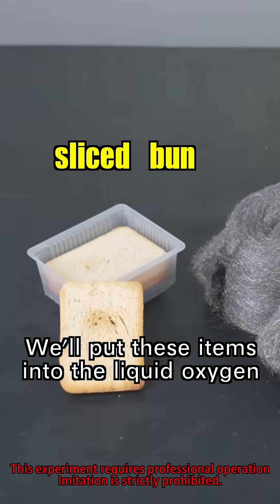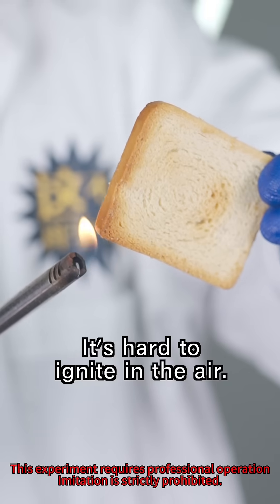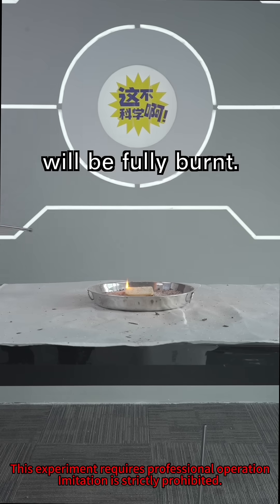That's not the end of it. We'll put these items into the liquid oxygen and see which one reacts most intensely. First, a sliced bun. It's hard to ignite in the air. The oxygen content of liquid oxygen is nearly 4,000 times that of the air, so the soaked sliced bun will be fully burnt.